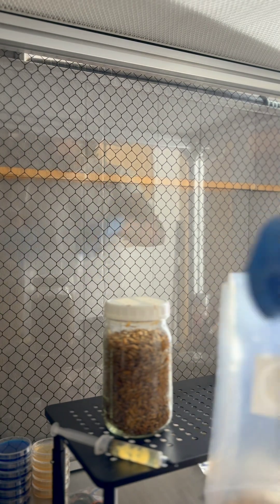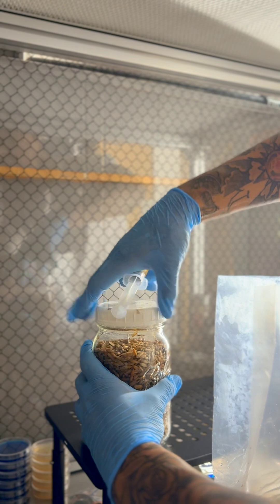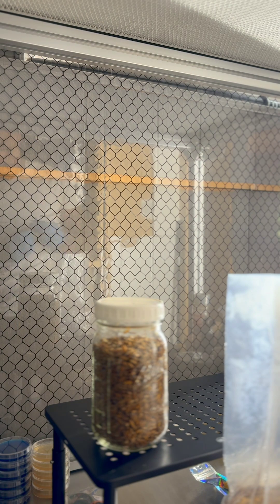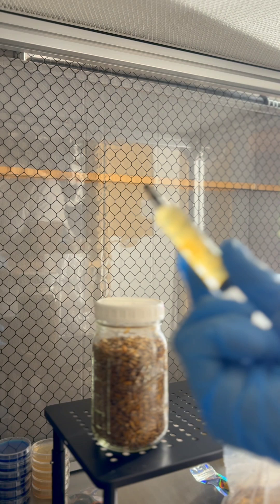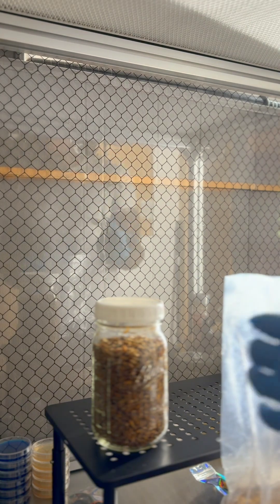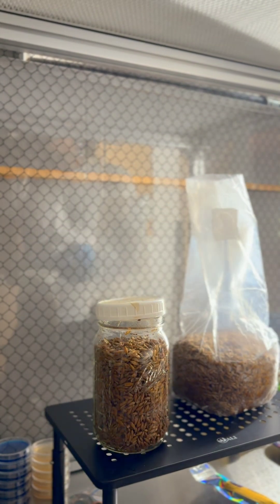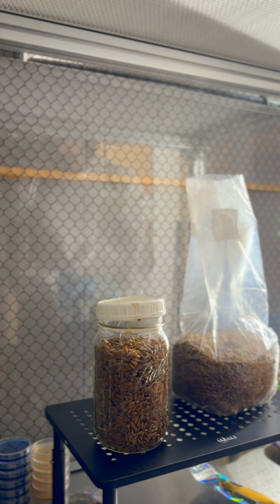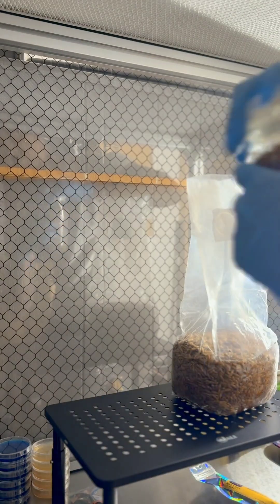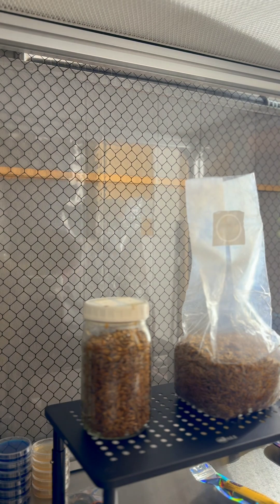Give your liquid culture a good little shake, open it up, and spray it right into the bag — one to two cc's. Same thing with the jar: open it up, one to two cc's. Cap the liquid culture off and put it back. Close the jar up. Now I'm gonna take this bag and seal it — I've got an impulse sealer down here.